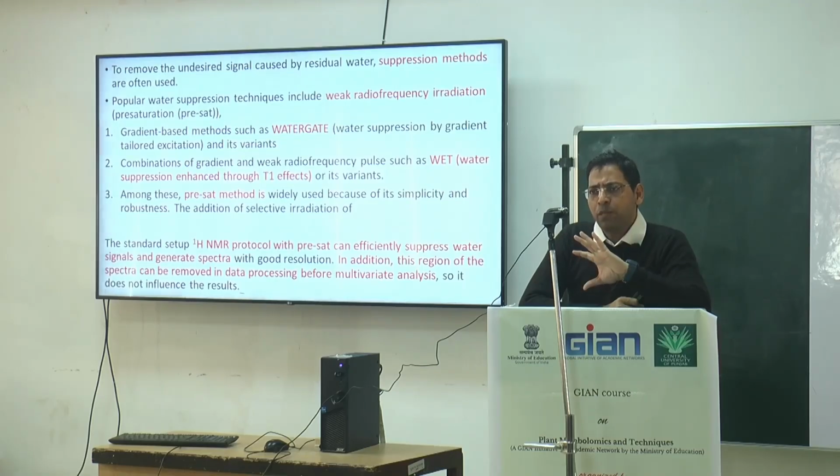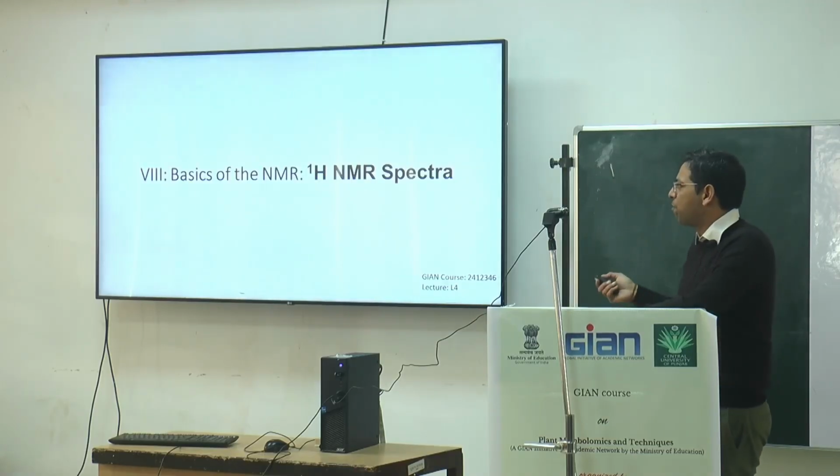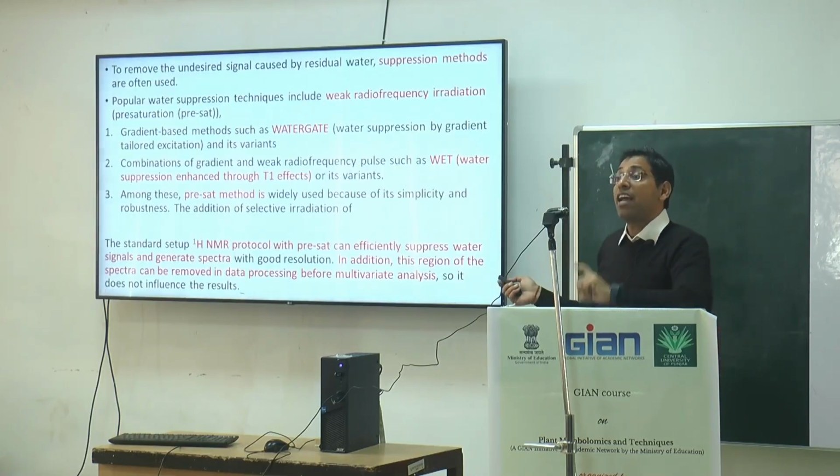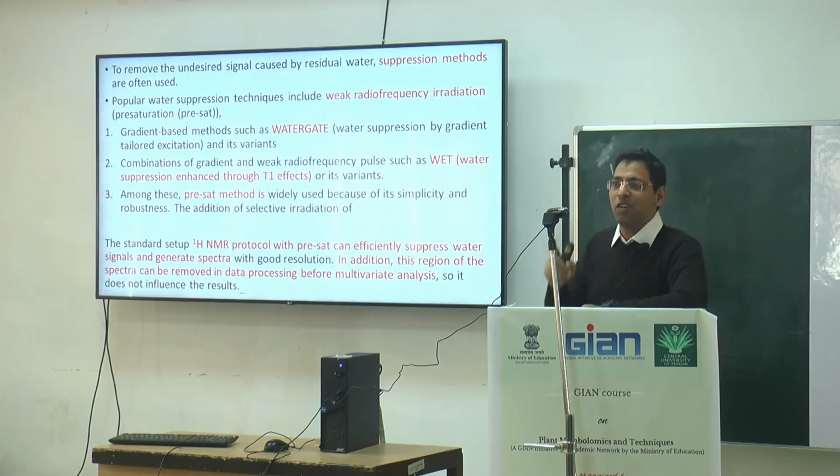There is already suppressed. Now you are getting the peaks of only your metabolites. So now before I go ahead with the NMR data, what type of spectra you are getting, I would like to take 10 to 20 minutes about the NMR. Until you know about the NMR, you are not able to understand the spectra of the NMR.